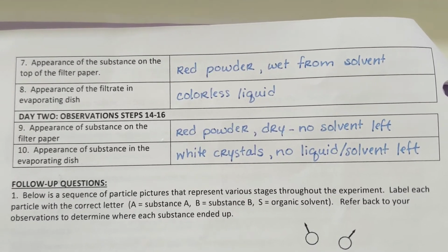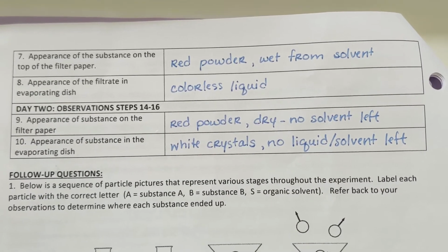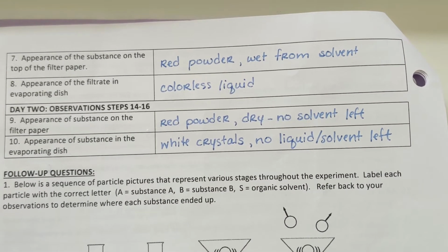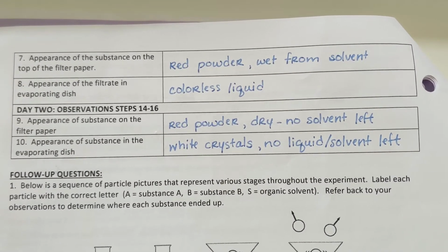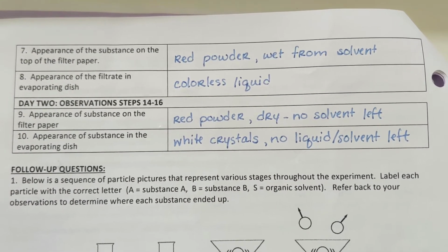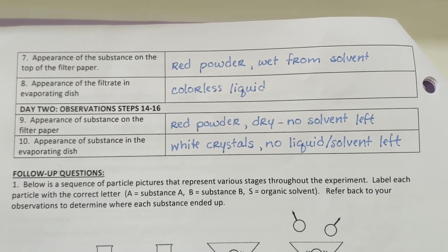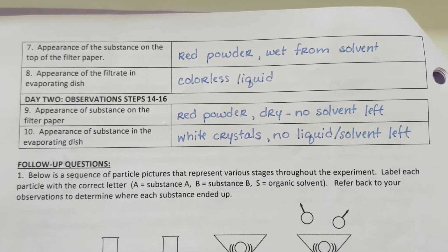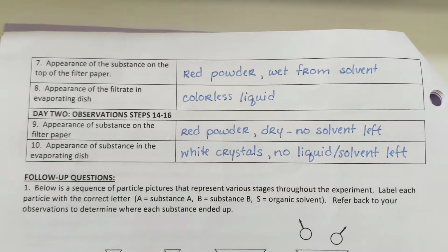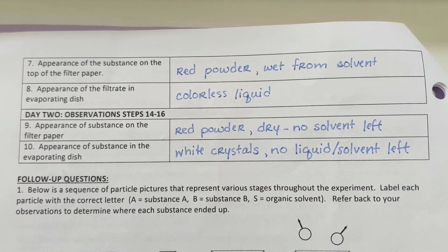On day 2, we noticed that the red powder was now dry, so any solvent that had been absorbed into the paper had evaporated. And we also noticed that there shouldn't have really been much liquid solvent left in the evaporating dish either, and because the liquid solvent went away as it evaporated, it left behind the solid that used to be dissolved in that solvent. So the solid that used to be dissolved is now white crystals, which looks a lot like what we saw in the test tube for substance A.